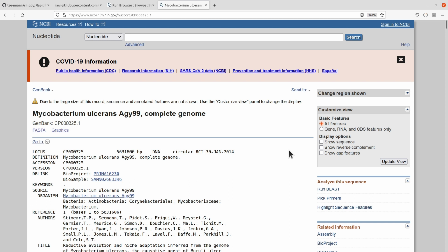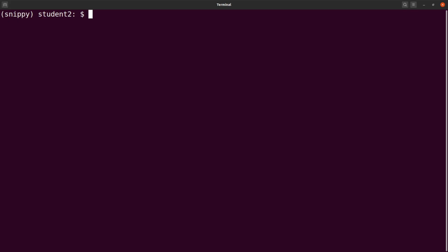The second approach uses Python to do the download. So with Python, you will need to also have the accession ID. Okay, we need this. We also need a database, but I'll do the demo on the terminal, so just wait and see. So let's go to the terminal and then let's type Python. Python is one of the tools we installed. If you use the YAML file, then Python is also installed together with the required library. So let's type Python.